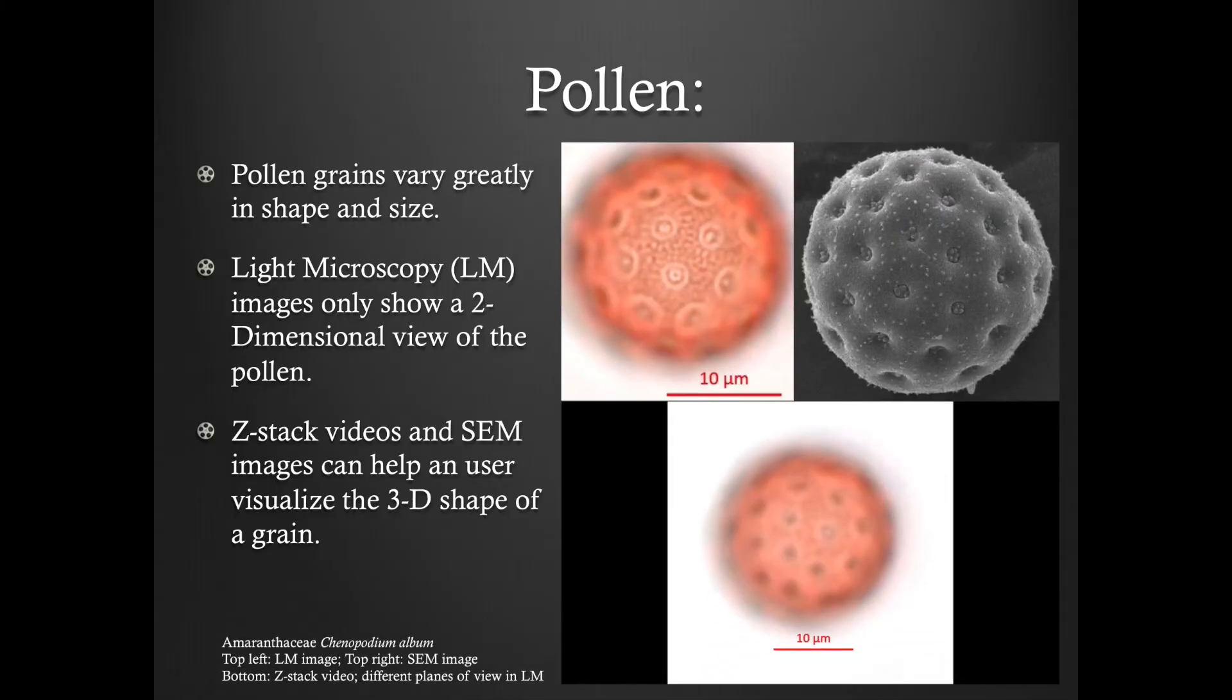Here is another example. This is an amaranthacy pollen grain. The image at the top left was taken with light microscopy. The image at the top right was taken with scanning electron microscopy. Below you can see the Z-Stack video. Videos such as these can help the user gain a better understanding of the morphological characteristics of the grain.